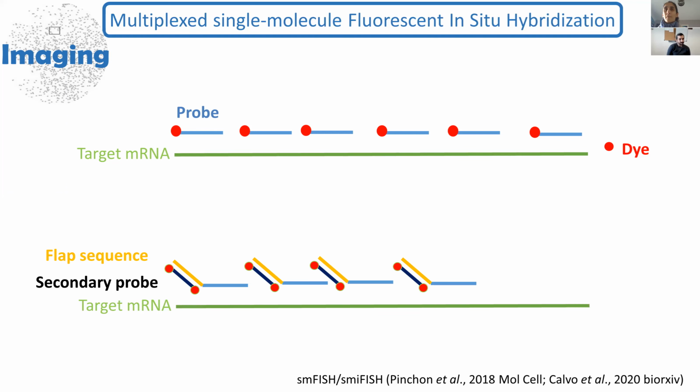Okay, so here at the IGFL, we use a technique that is called single molecule inexpensive fish.